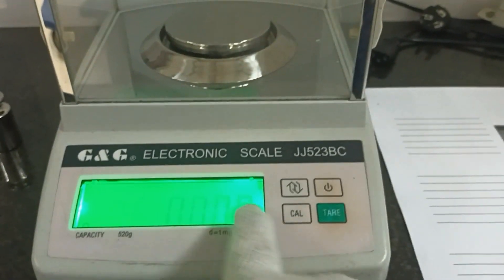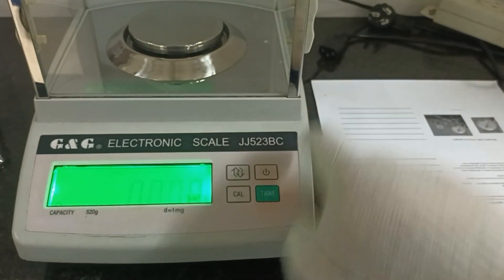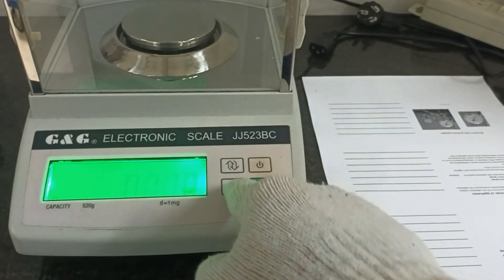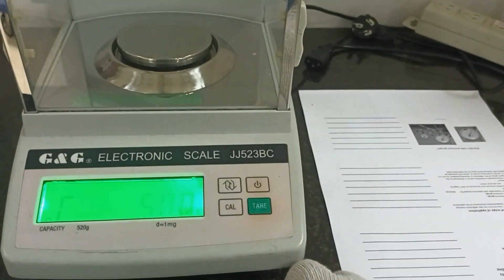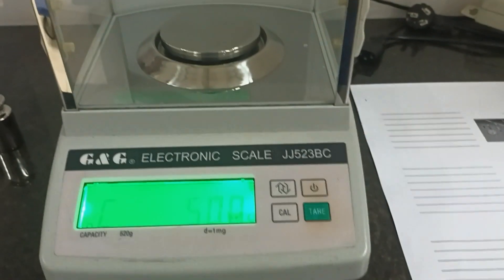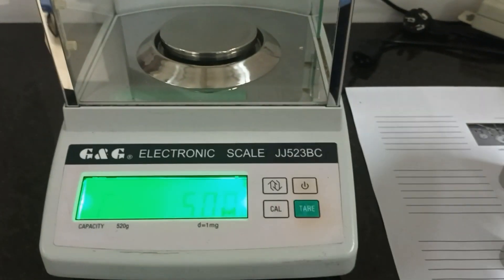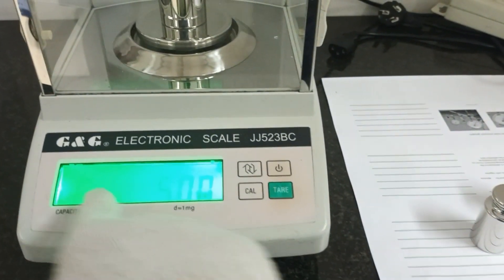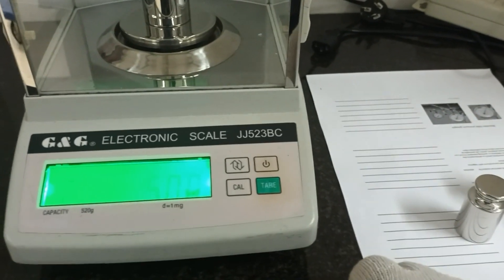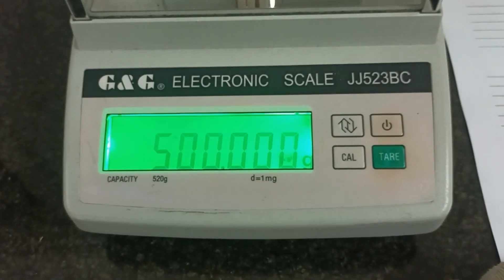I will put the key card. The balance shows 500 gram. I will put the standard 500 gram on the pan and wait a moment. Okay, it's okay — the balance shows 500 gram.